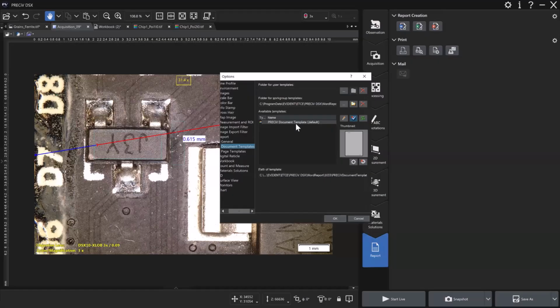Yeah, so you have something called a document template, and will it let me open the folder here, edit? Oh, down here. I'll just go to it and open it directly. There we go. It doesn't want to let me do it on here, but I'm going to do it this way. Bear with me. So you can take this document template, this is the Word one, and it will allow you to open it in Microsoft Word.